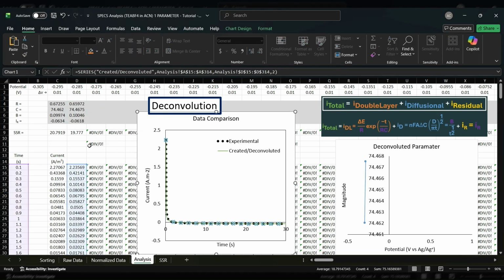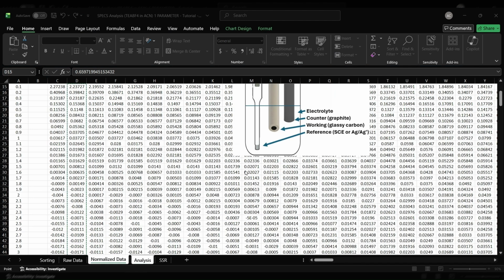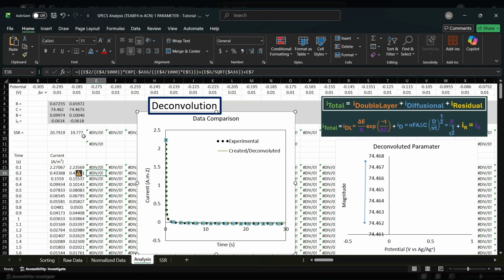Okay, so I'm quite happy with that. I have moved the graph over to be onto D. Same with the experimental data, it will now be sitting on D. So they overlay each other really nicely. So I am personally happy with that.